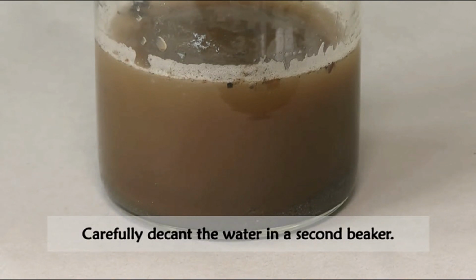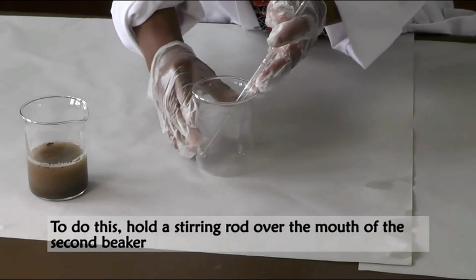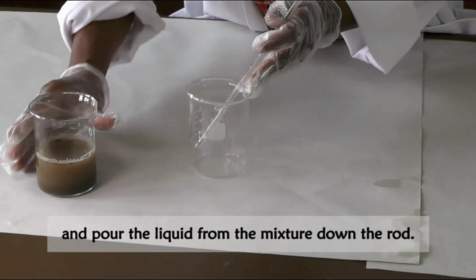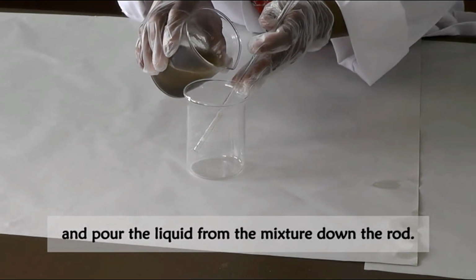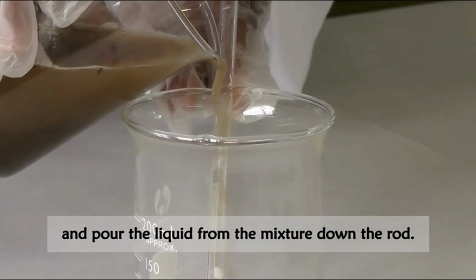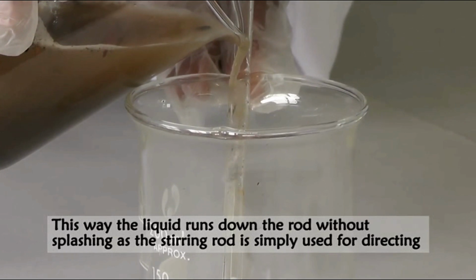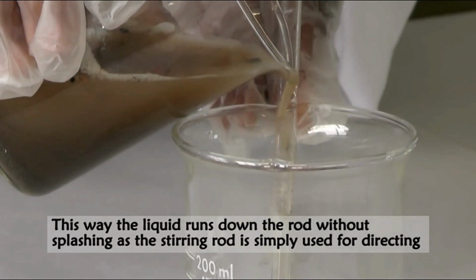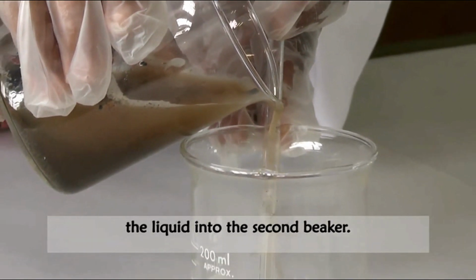Carefully decant the water into the second beaker. To do this, hold a stirring rod over the mouth of the second beaker and pour the liquid from the mixture down the rod. In this way, the liquid runs down the rod without splashing, as the stirring rod is used for directing the liquid into the second beaker.